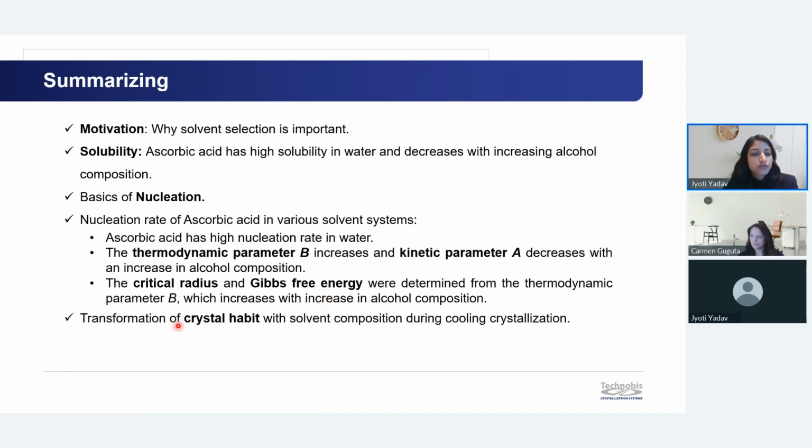Then we saw the transformation of crystal habit with the solvent composition during cooling crystallization experiments. More cubic shaped crystals were formed in water, and with the addition of alcohols, more elongated crystals were formed. And then we also saw the role of AI, how Crystalline instrument uses AI to detect particles in terms of particle size and particle shape.